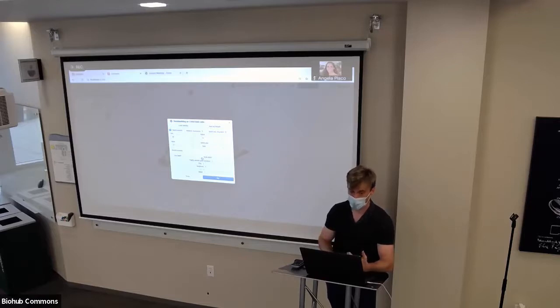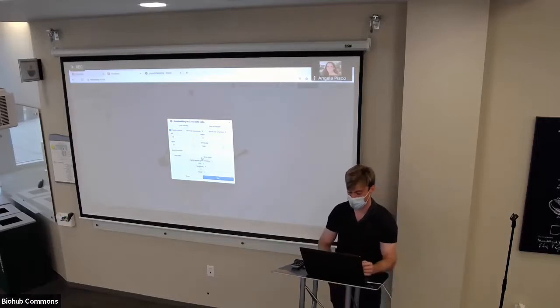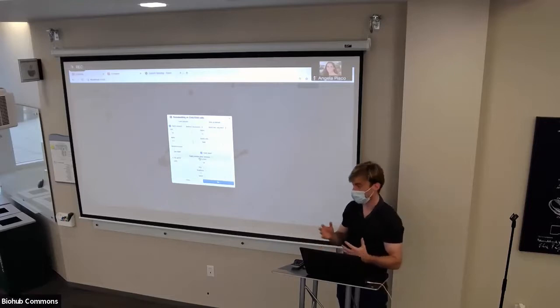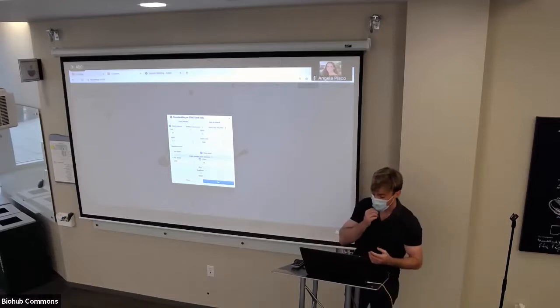Because if you have a gene that's on in a third of your data set, then standardizing will actually make its signal weaker. You can think about it and do some math to prove it, but that's my recommendation. Keep this checked only for big data sets with a lot of cell types. So you would scale your data. And now this is the feature selection step I was telling you about, where you further limit yourself to the top 2,000 genes based on some metric.